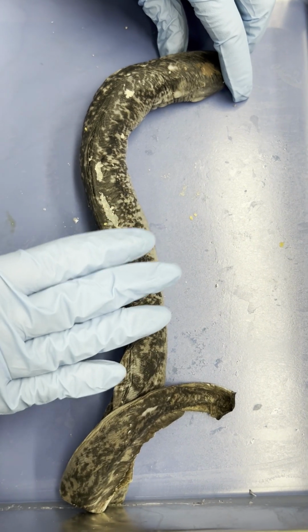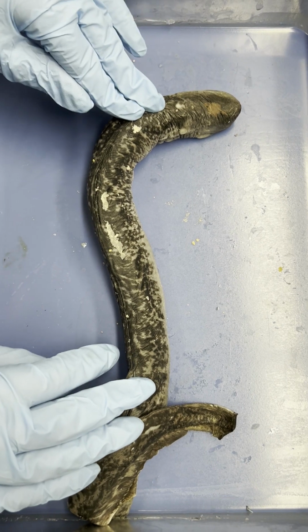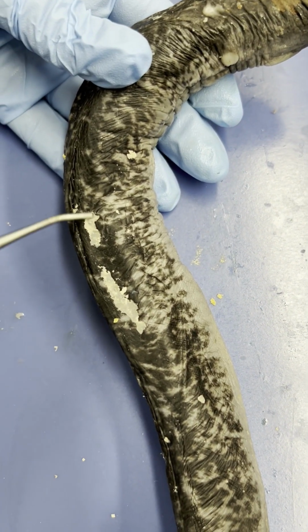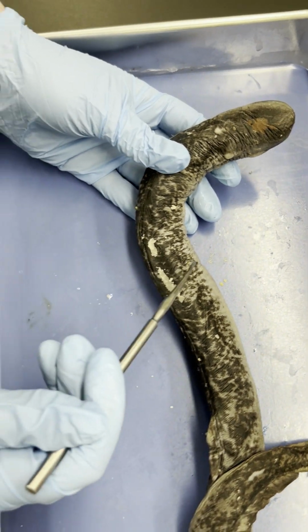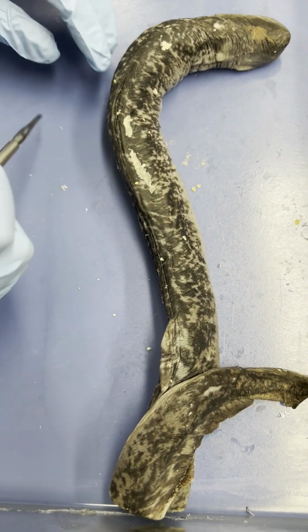We're only going to cut 4. So again, you're going to get a new specimen. Some of these specimens do have some mold growing on them. On this guy, we can see that there's a little along here. So I would just say for these, use your moldier specimen for the cross sections, just since you're generally going to have to handle it a little bit less.